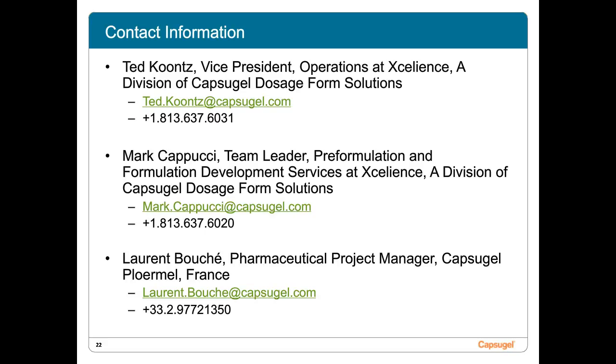Speaking from a GMP manufacturing perspective, typically the rate limiting factor is the fill weight. So again, the Xcelodose filling method is converse to a typical capsule filling. On normal capsule filling equipment, a higher dose works better. It's easier to control the weight, but on the Xcelodose, a lower dose actually works better. A 1 milligram fill or a 5 milligram fill, it's quicker to fill. If the fill weight's 25 or 50 milligrams, it just prolongs the filling because you're physically sitting there waiting for the powder to fill the capsule body.